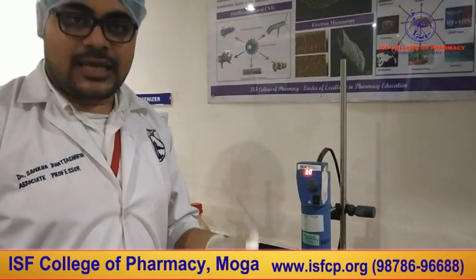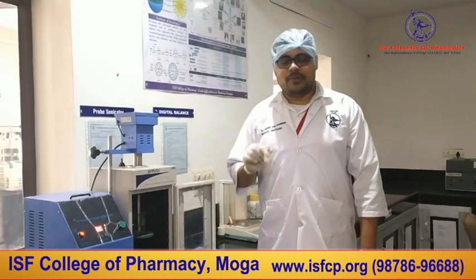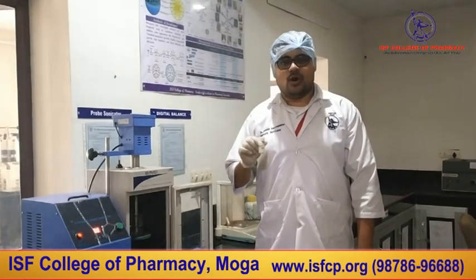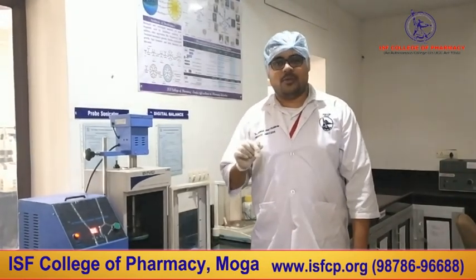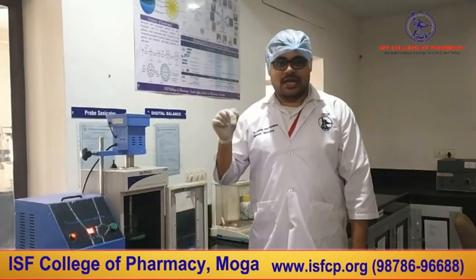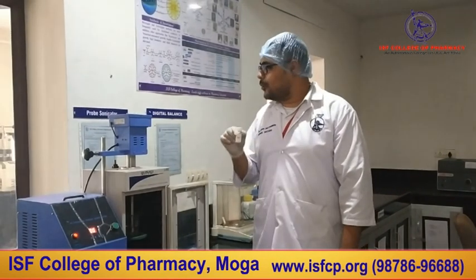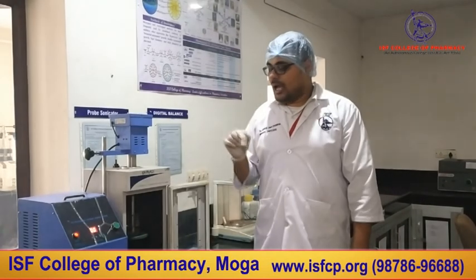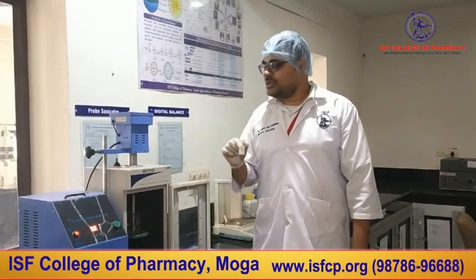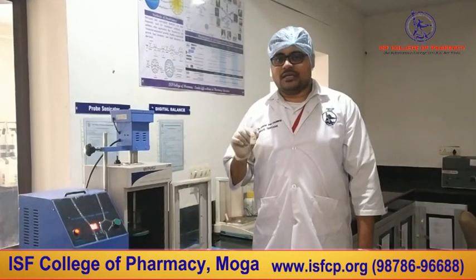Next step is probe sonication. After preparing the nano-emulsion utilizing high speed homogenization, it is very important to go for nanonization of our nano-emulsion. For that purpose, we need a probe sonicator. Friends, in our laboratory, we have a probe sonicator with a capacity of 20 kHz.